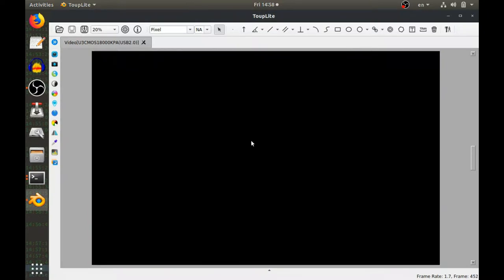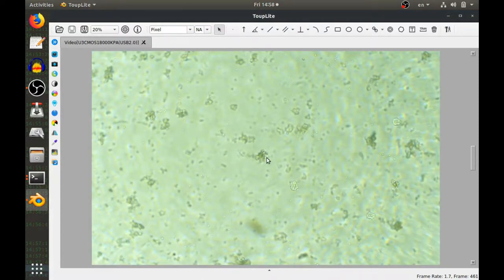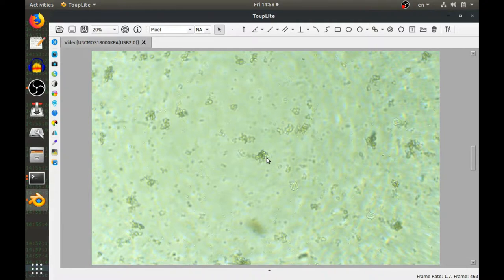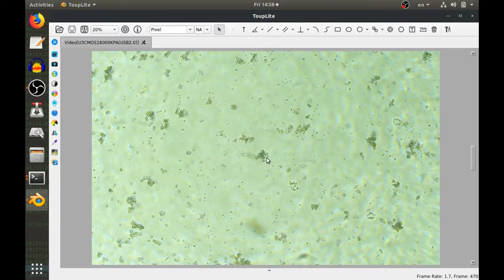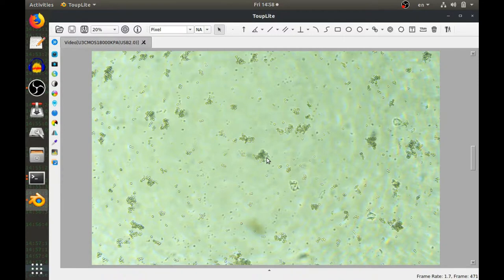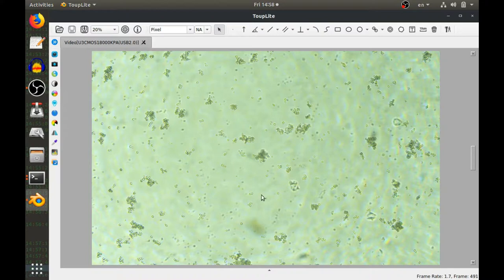Let's increase the magnification so we can see more of the cells. You need to just adjust the focus a bit. There we go, you can see some of the yeast cells here. They are alive, at least I think they're alive. They don't look like they are dead or anything, but as I am aware, they don't move.